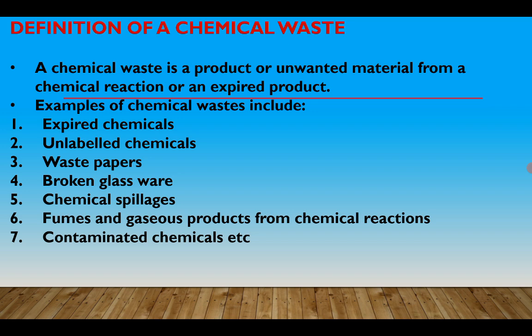Usually expired products or expired chemicals may not give desired results if used in a chemical reaction. So for that reason, there is no need to keep such products in the lab because they may become a hazard to the laboratory users. In this case, the teachers, the laboratory technicians, as well as the students.